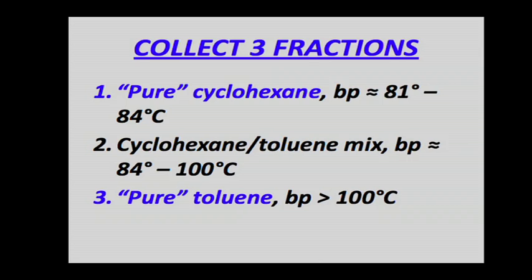When the temperature exceeds 84, we'll switch flasks and collect a middle fraction, which is a cyclohexane toluene mix. And we'll continue to collect that fraction between 84 and 100 degrees. And when the temperature at the top of the column finally reaches 100 degrees, we switch to collect the third fraction, which I'm calling again, pure toluene, pure in quotes. And anything over 100 degrees is going to be mostly toluene. So we'll have a lower boiling fraction that'll be heavily concentrated in cyclohexane, and a higher boiling fraction that's heavily concentrated in toluene, and a mid fraction that's a combination. So it won't have been a complete separation. It'll be a partial separation, but this is the way that gasoline and other petroleum products are separated by fractional distillation. So it's common, very common industrial technique, and it's a technique that we'll have to use sometimes when we have to separate materials that are closely boiling.